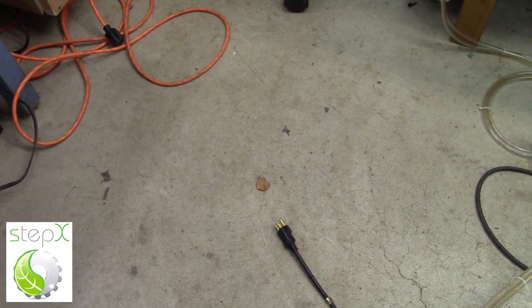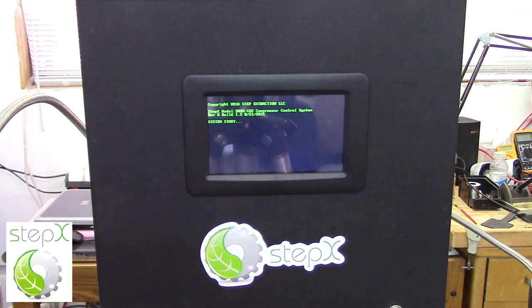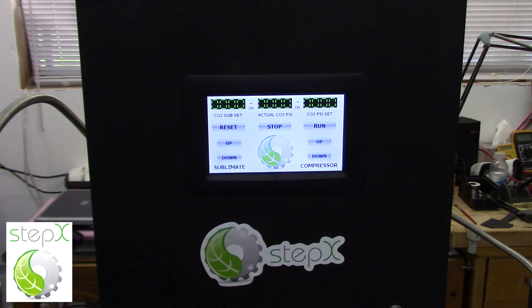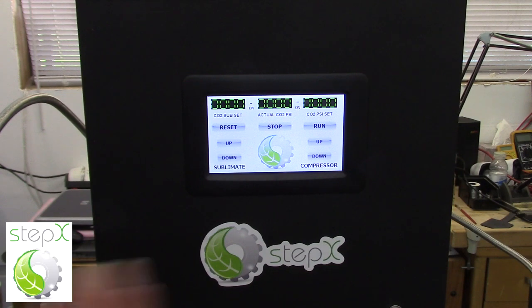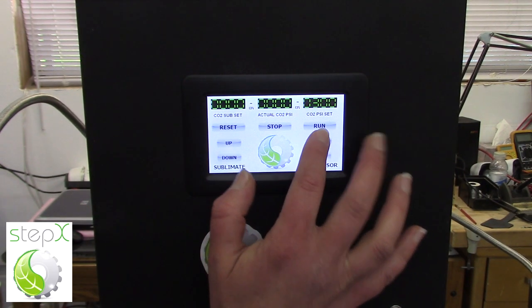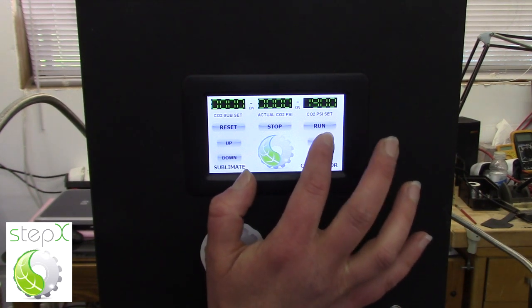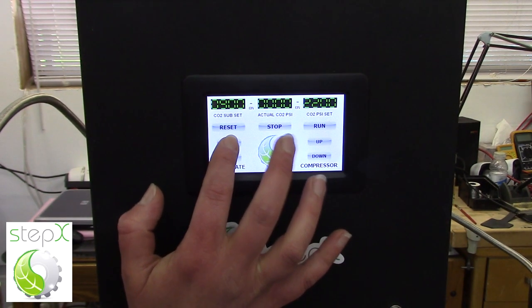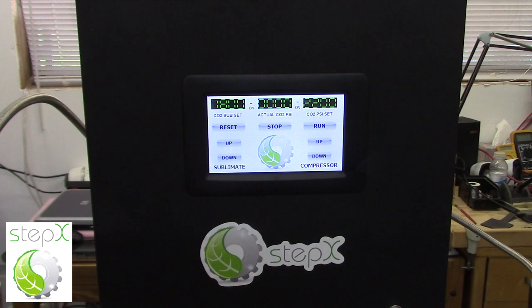Now it's time to turn on the compressor. The first thing I want to do is plug it in. As the computer is booting up — now it's ready to go. I'm going to set the compressor at 2200 psi and the sublimation pressure at 1800 psi. And now I just hit run.